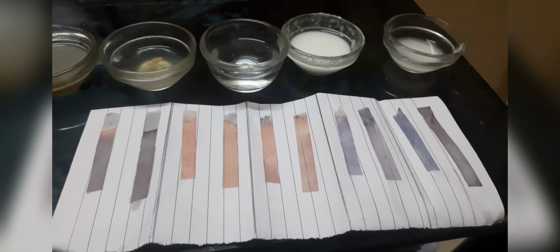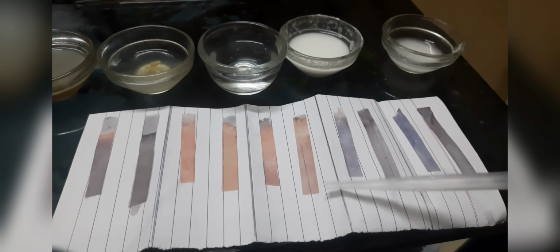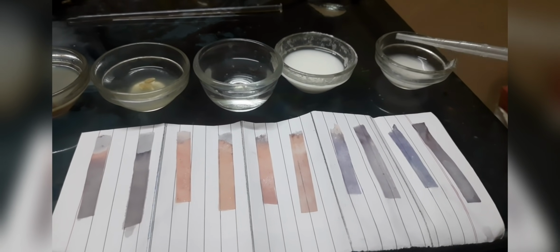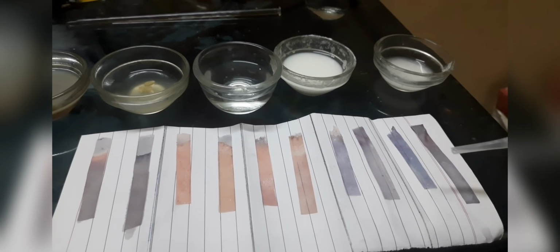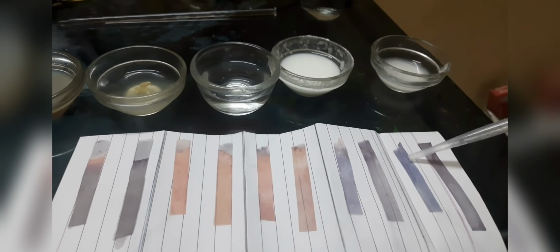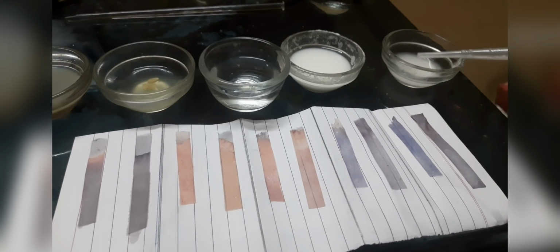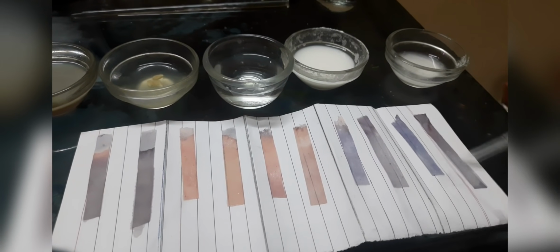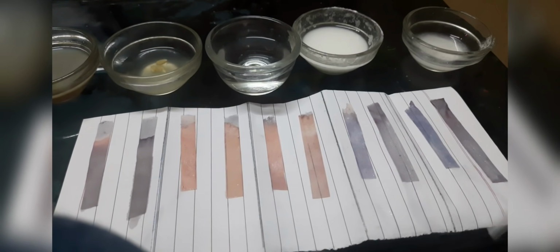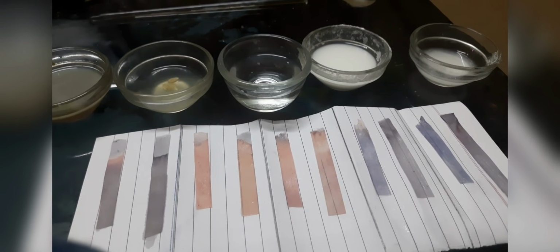So here the results are ready to see, and now it's a bit more clear, so you can check them out. What is the result? The first solution we checked was the bleaching powder, and over here you can see the result. The red litmus turned very dark blue, which shows a base. But nothing happened to the blue litmus, it is still blue. So we can say that the bleaching powder is basic.